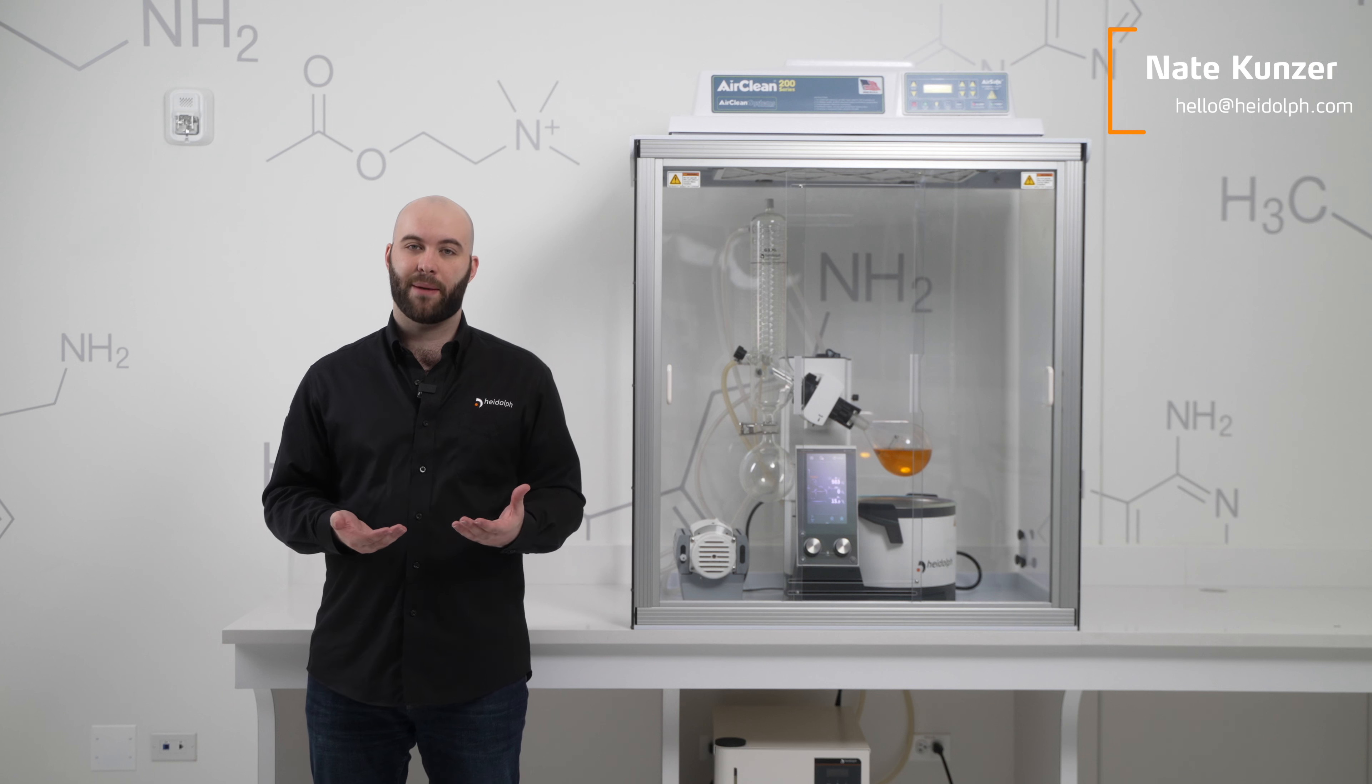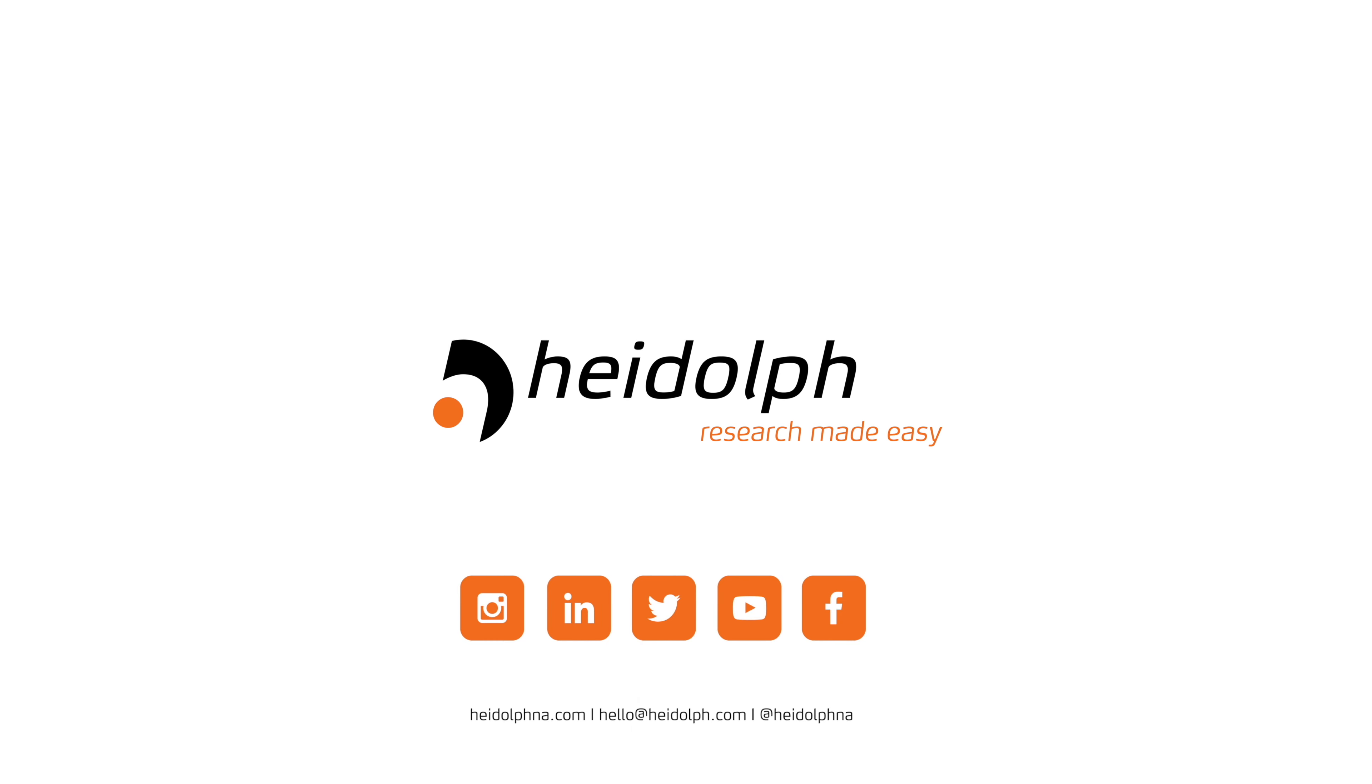The air clean enclosure has multiple different access points so you can thread power cables or your chiller tubing into it. They're conveniently located so you can put your chiller underneath your lab bench and run it through the back and still get inside of your enclosure.